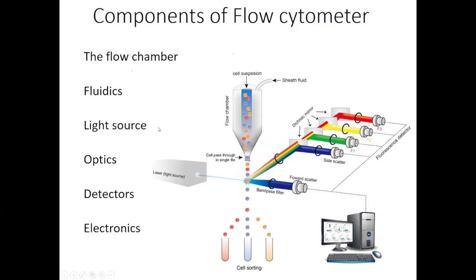So any doubts till now? Can I go for the next component? So we are finished with flow chamber, fluidics, and light source. Now we need to go for optics. So any doubts till now?